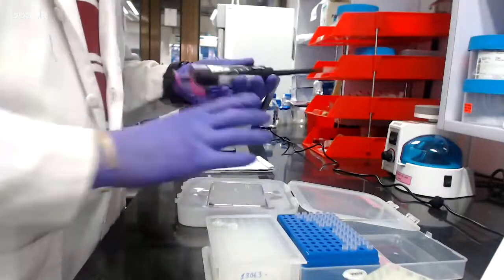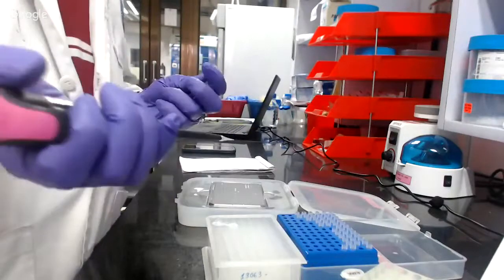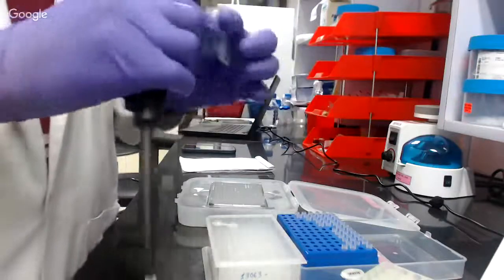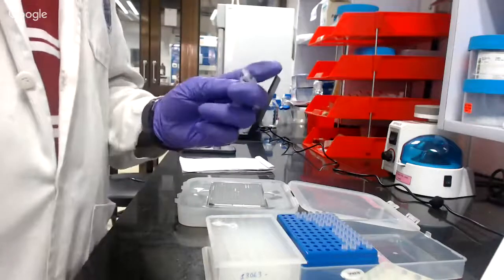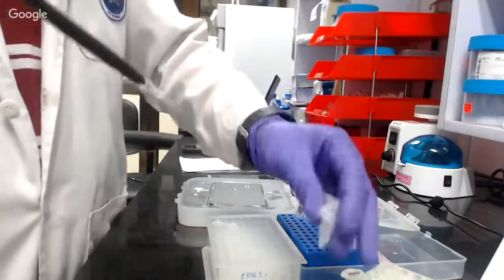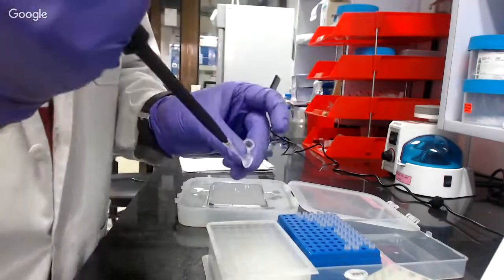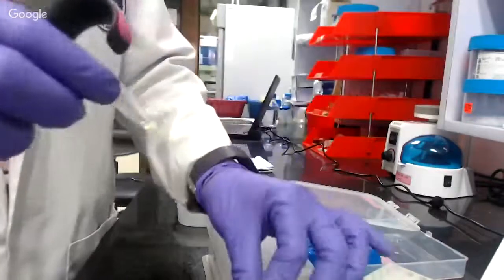So basically, Aishwarya already explained about the matrix and the sample, like which matrix is suitable for which type of samples. Today I have digested proteins, that are basically peptides. So we take an equal volume of the peptides, that is the sample. I am taking 2 microliter of my peptides, then I will keep it in the Eppendorf tube, then I will take 2 microliter of the matrix.